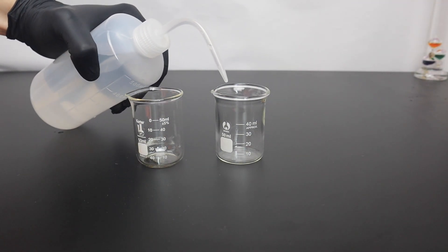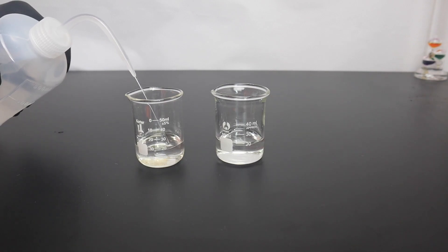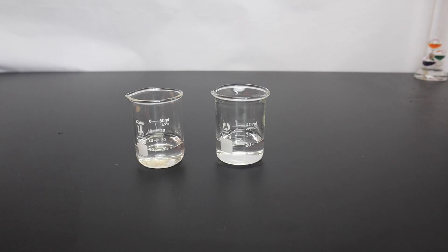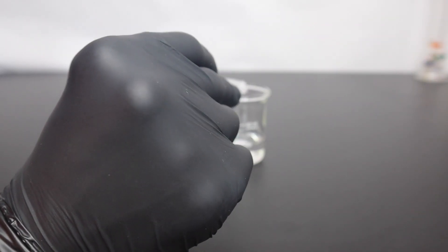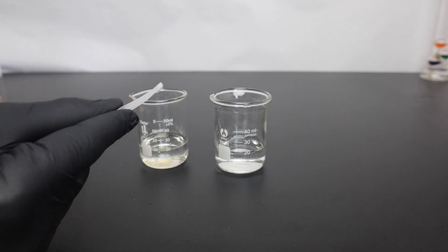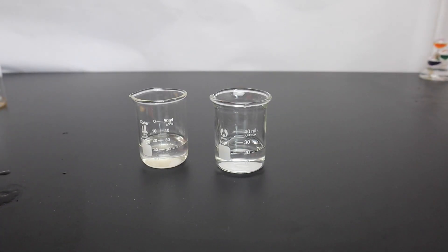In this video I'm going to demonstrate the iodine clock reaction. First I put 20 milliliters of water into two separate beakers and then I added a small amount of sodium iodate to one of them. To the other I added a small amount of sodium sulfite, citric acid, and a few drops of saturated starch solution.